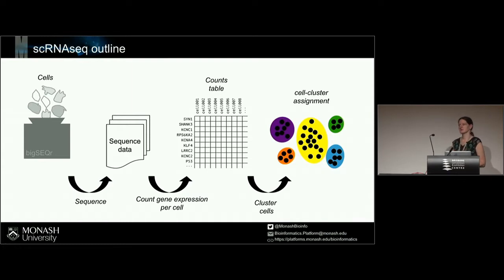We take those sequences, align them to a reference genome, and generate this counts table. It's a big table with cells 1 to 2,000 odd, however many you have, and for each cell, how many times each gene was seen in that sample. So 0, 1, 5, however many times. That's a really core result in any RNA-seq, and especially in single-cell RNA-seq analyses, as you've already seen before.